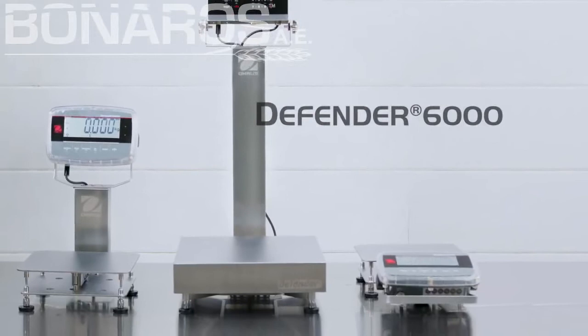The Defender 6000 Extreme Washdown Bench Scale. Weigh it. Spray it.